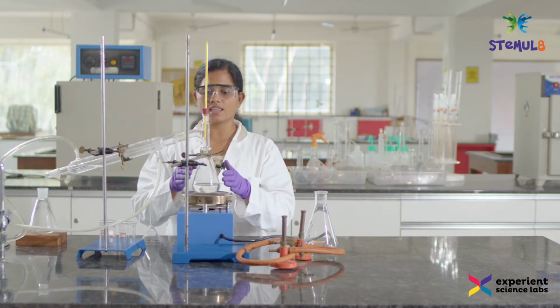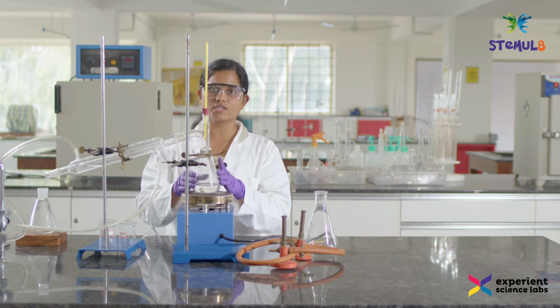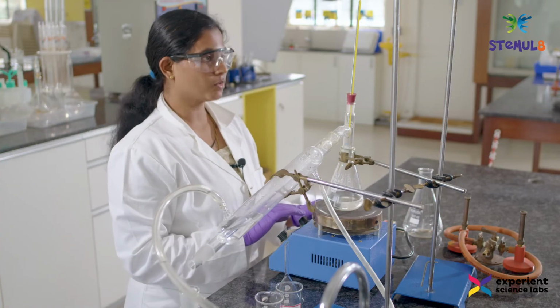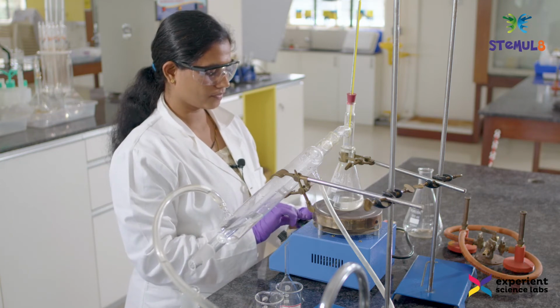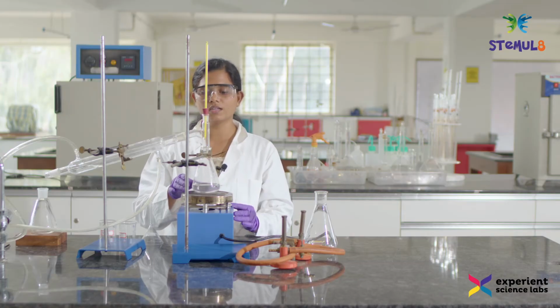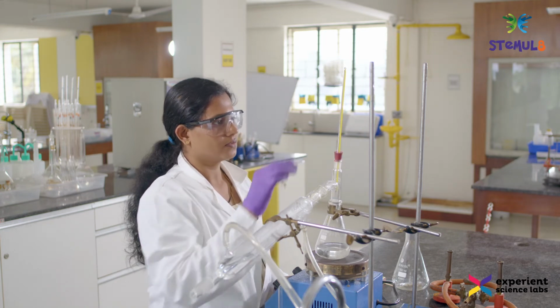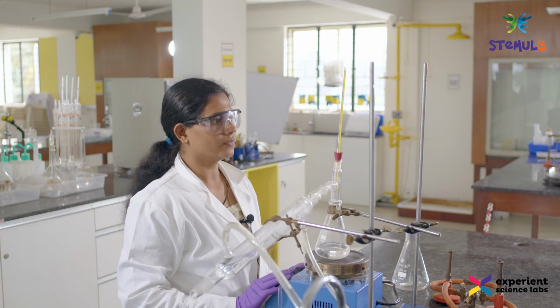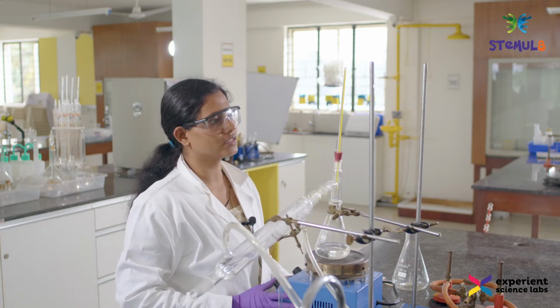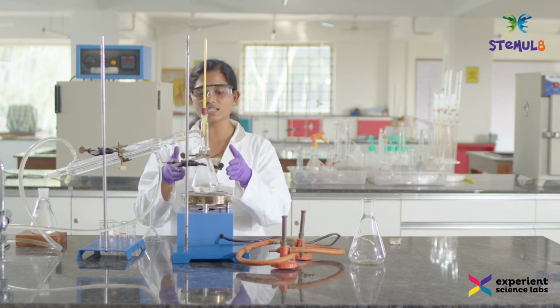This is a heater, and before we switch on the heater, make sure that you also put anti-bumping granules into this conical flask. I have used pebbles in the conical flask, and now I am going to start heating it. So I need to wait for some time. Now the temperature in the thermometer is 28 degrees Celsius. So when we start heating it, let's check at which temperature the first solvent distills and condenses into the receiving flask. So now you see the solvent mixture inside the conical flask is getting heated up.